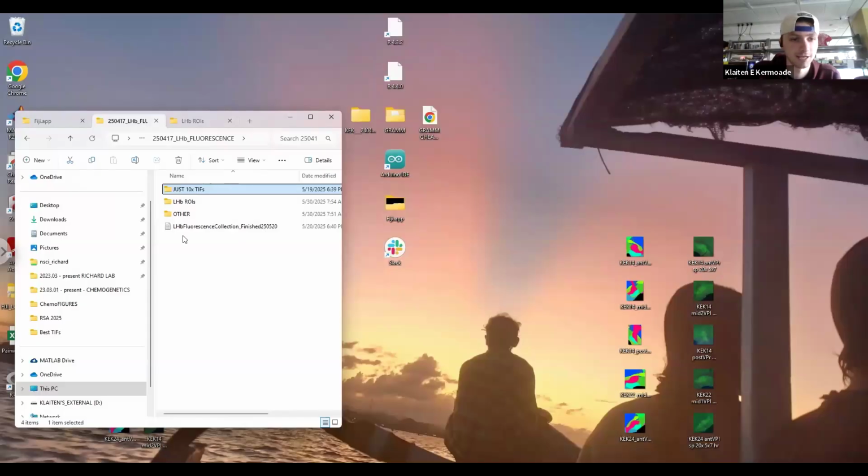Recording on the day that I'm flying out, but I'm going to show you the LHB fluorescence script really fast. I'm sharing my screen right now. Hopefully we can see that. And we'll just get into it.